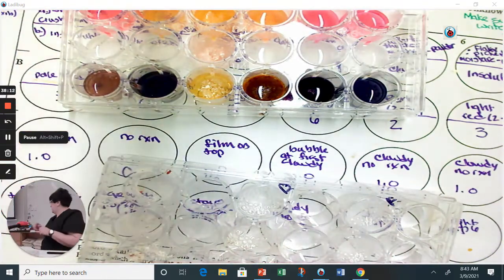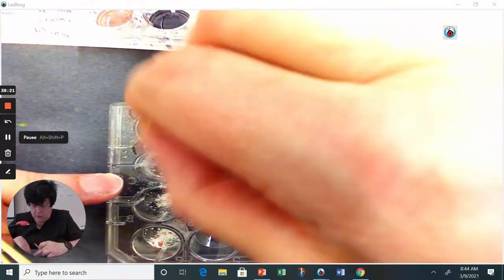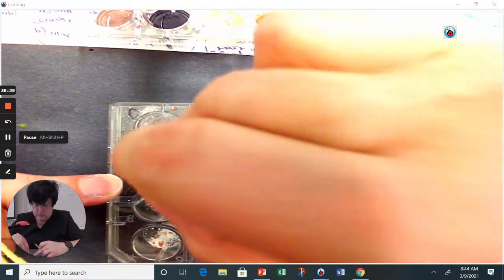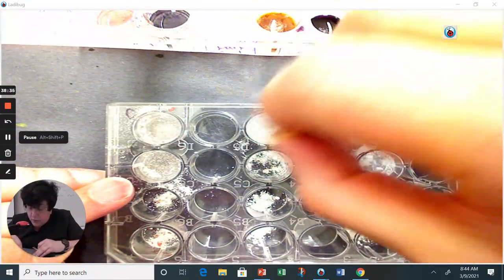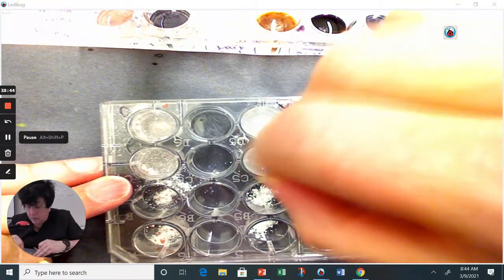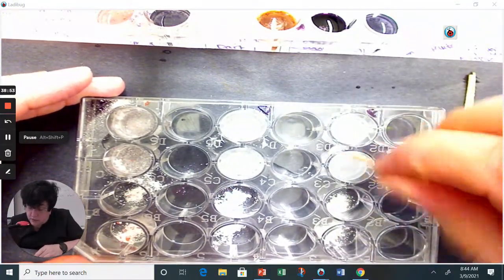I'll get the black paper so you can see how well it dissolves. And then I'm going to hold them close to those so you can see in the end what they look like. I'm also going to stir this one up a little too. Okay, for C, it looks like the coating is dissolving and the other part is floating. B doesn't look like it's dissolving. It's sitting on the bottom. And not B, I'm sorry, D. This is D. And F is slightly soluble. It gets cloudy.